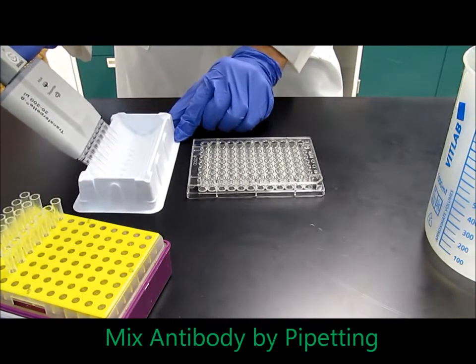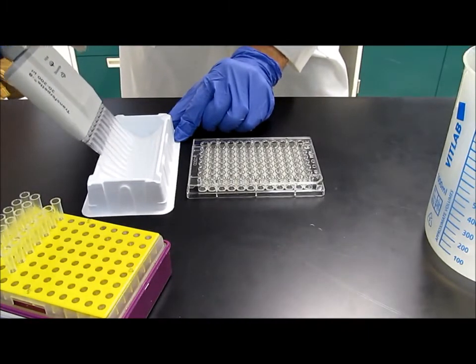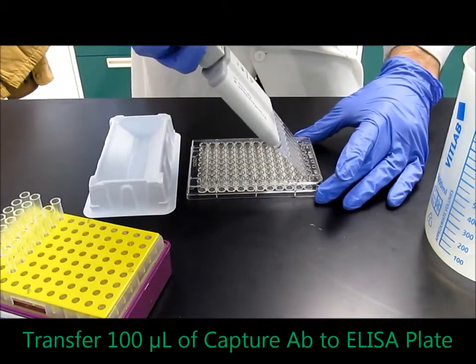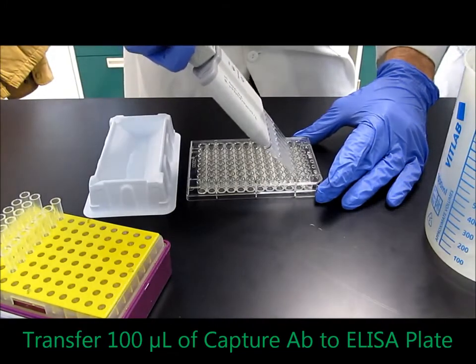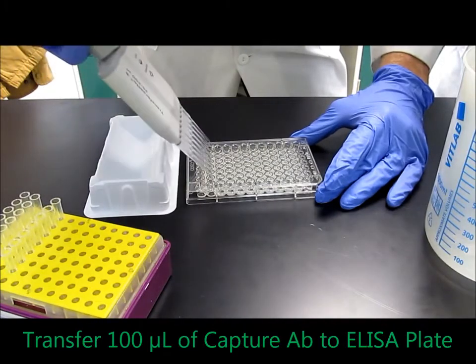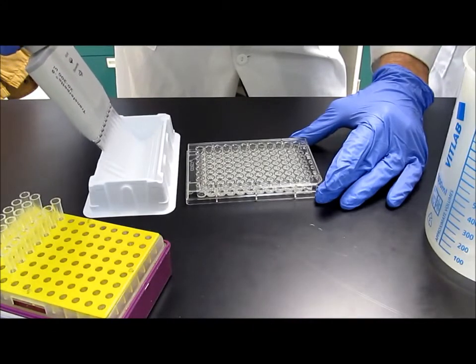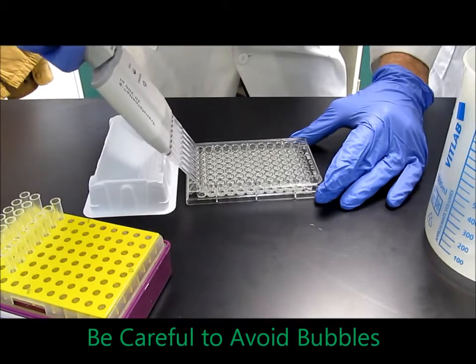Once you feel that it's well mixed, carefully take 100 microliters without getting any bubbles and start pipetting it into each well of the 96 well plate. Now you're just going to have to keep going back and forth until you finish all the wells of the plate. Jumping right ahead to the last one, this is usually the trickiest one because you're almost out of reagents, so you have to be careful not to get any bubbles. But once you feel satisfied that you don't have any bubbles, just add it.